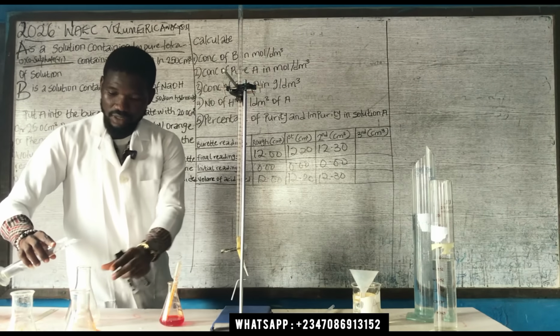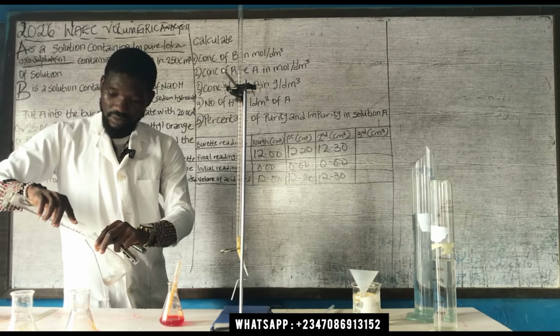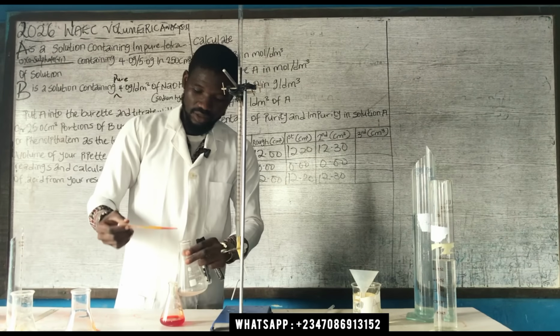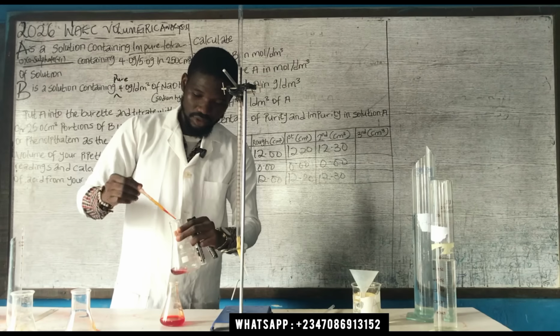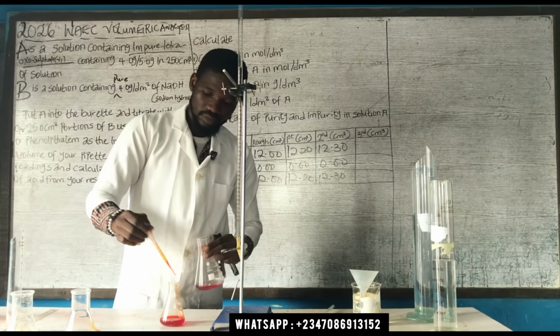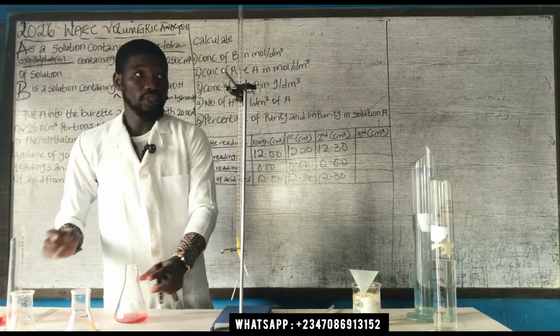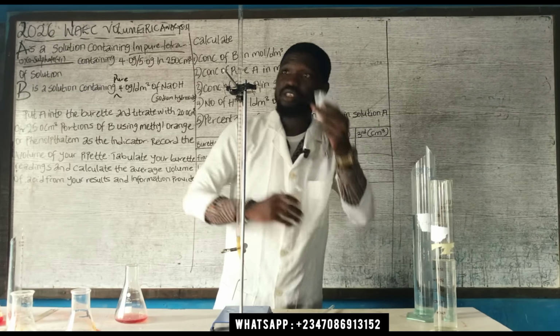You have this. So the first drop and the second drop. So don't forget, you have to refill your burettes.